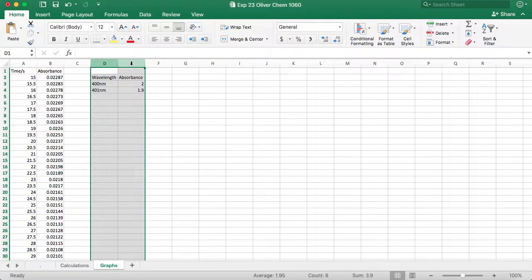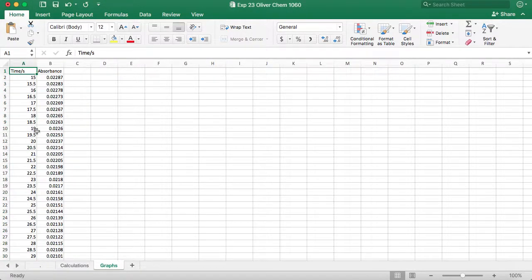Kind of the same equipment, but as you can see, it's graphing time against absorbance. So basically, you pop the cuvette in the machine, the colorimeter, and it's scanning. It's going like 1 second, 2 second, 3 second, 4 second, 5 second, and it's saying, okay, how much did it absorb? So it's like a digital numerical video of how much we absorbed at each second in time, at that very second.